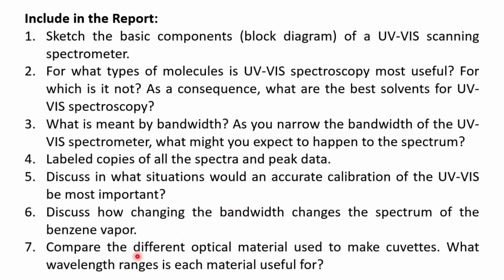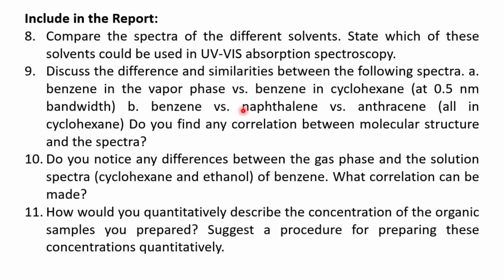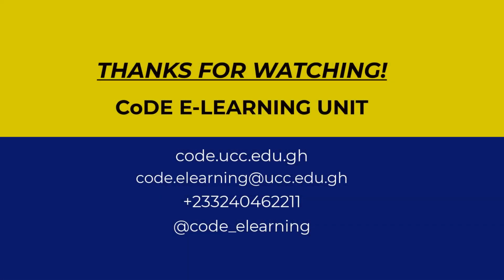You should be able to compare the different optical materials used to make cuvettes. So we have different types of cuvettes, what materials are being used, and what ranges of wavelength these materials absorb. The list goes on and on.